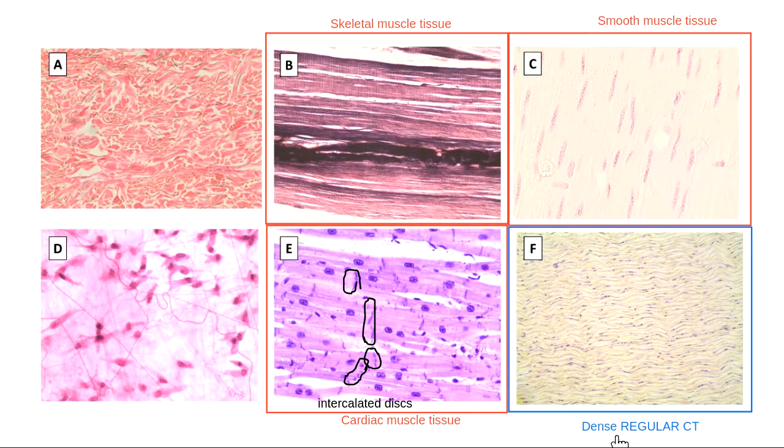When we're in dense regular connective tissue, these really small black dots actually represent individual cells that are inside this tissue. We talked about this morning in our review session that the name of those dark cells that I find inside connective tissue like this, they're called fibroblasts. That means fiber builders. All of these squiggly lines inside of here are collagen.